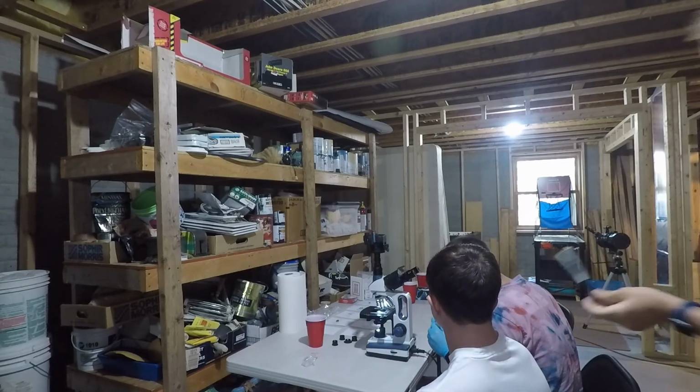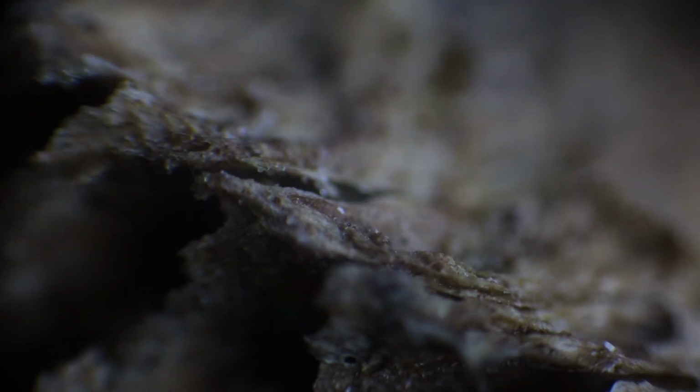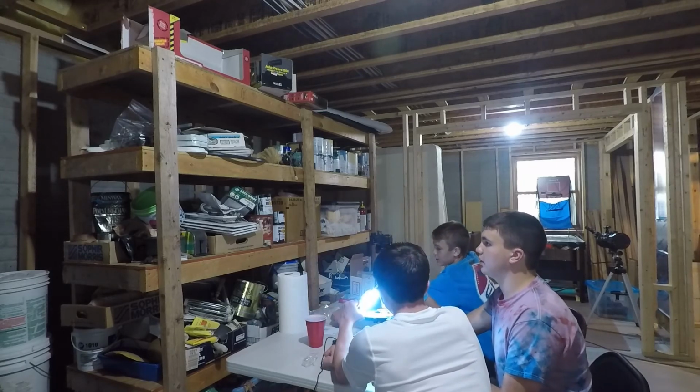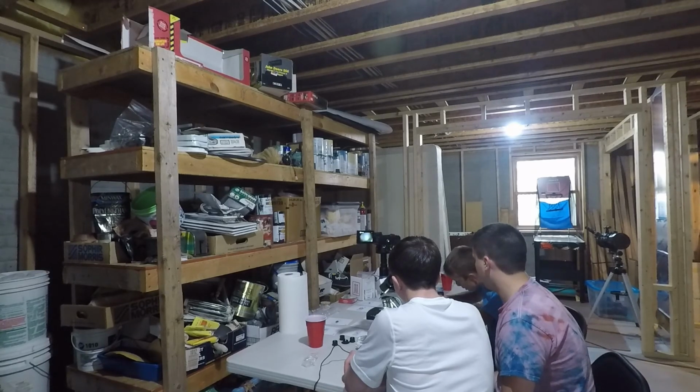Out of 10? Yeah. Okay, so now we're looking at the praying mantis egg, which is number 2. It's blurry because your plane of focus is like a millimeter. So, what do you rate it? That was kind of cool. I'll give it a 7. So now we're looking at a stem. We're going to zoom in a little more here. Well, just say a number. More than 8. Highest yet.